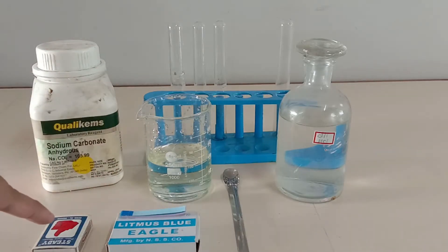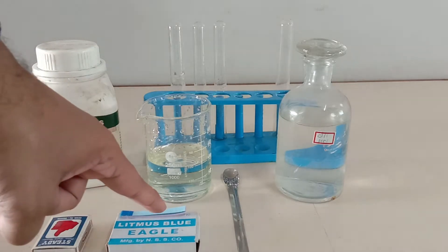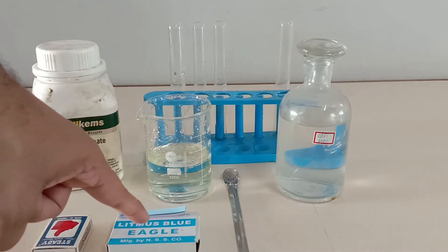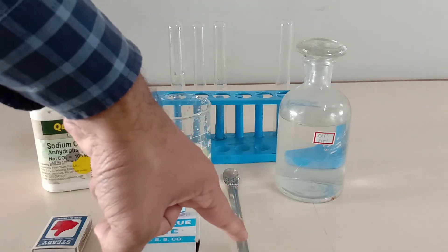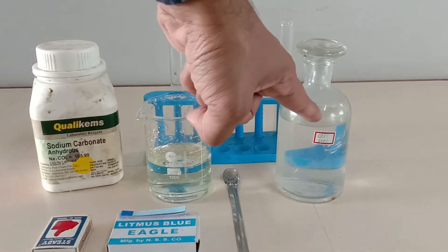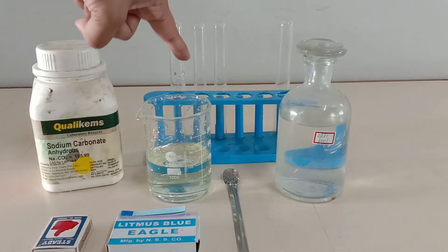We will also need a matchstick box, blue litmus paper, some water, a spatula, dilute hydrochloric acid, a few test tubes, and a test tube stand.